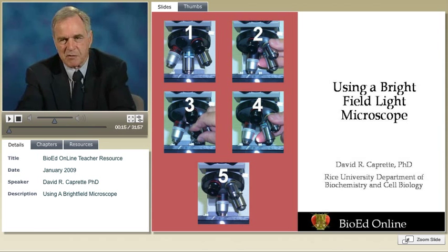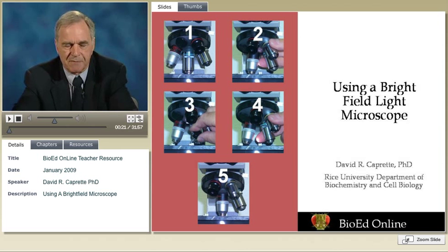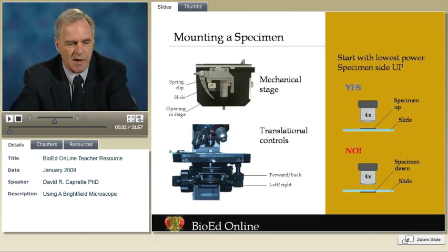When I teach students how to use a brightfield microscope, I take about 30 to 40 minutes to go through all the features and have them work with a specimen, working their way up from low magnification to high. As they go along, I give them a bunch of pointers, and I'm going to share some of those pointers with you now.